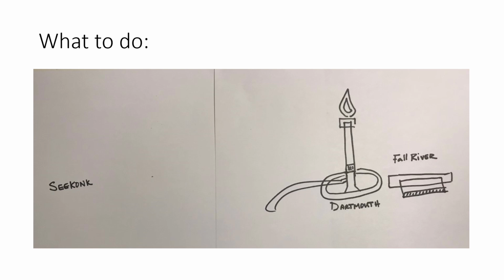We would light our Bunsen burner, and then when we do our streaking, we want to keep our petri dish close to the Bunsen burner. You see, what happens when we light the burner is that it heats the air and hot air rises, right?